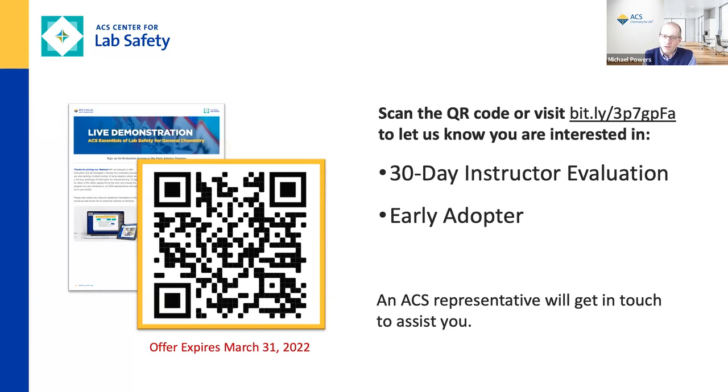Yeah, but I think regardless of lab size, the concepts and the RAMP framework and the framework for the content strategy here applies to large and small labs. It's really about how to be safe in a lab as opposed to specific to a type of lab.